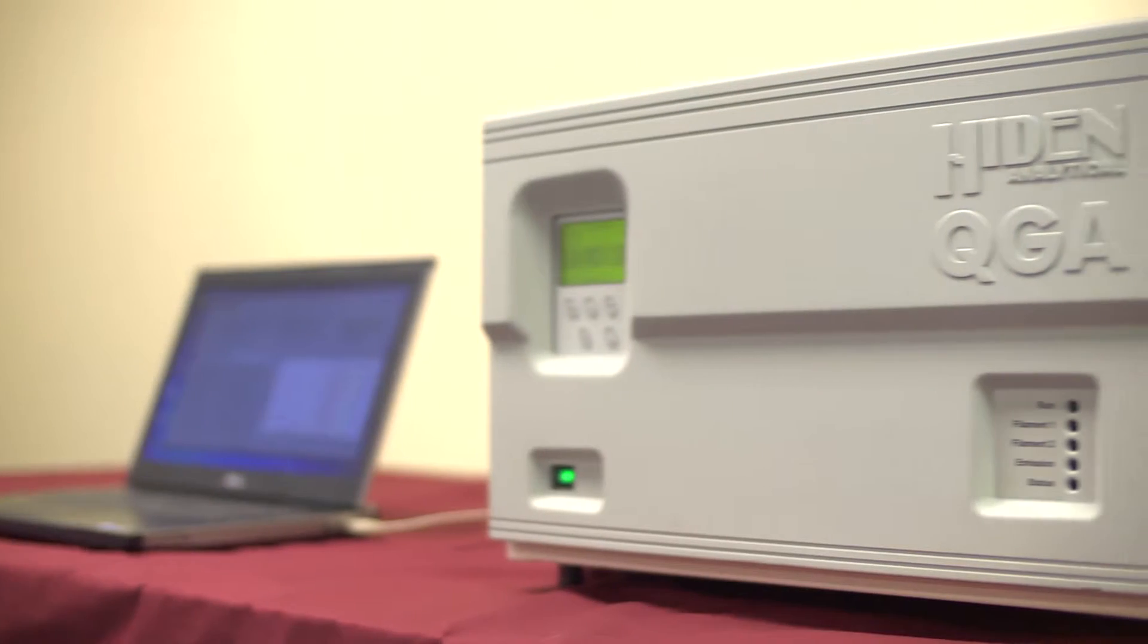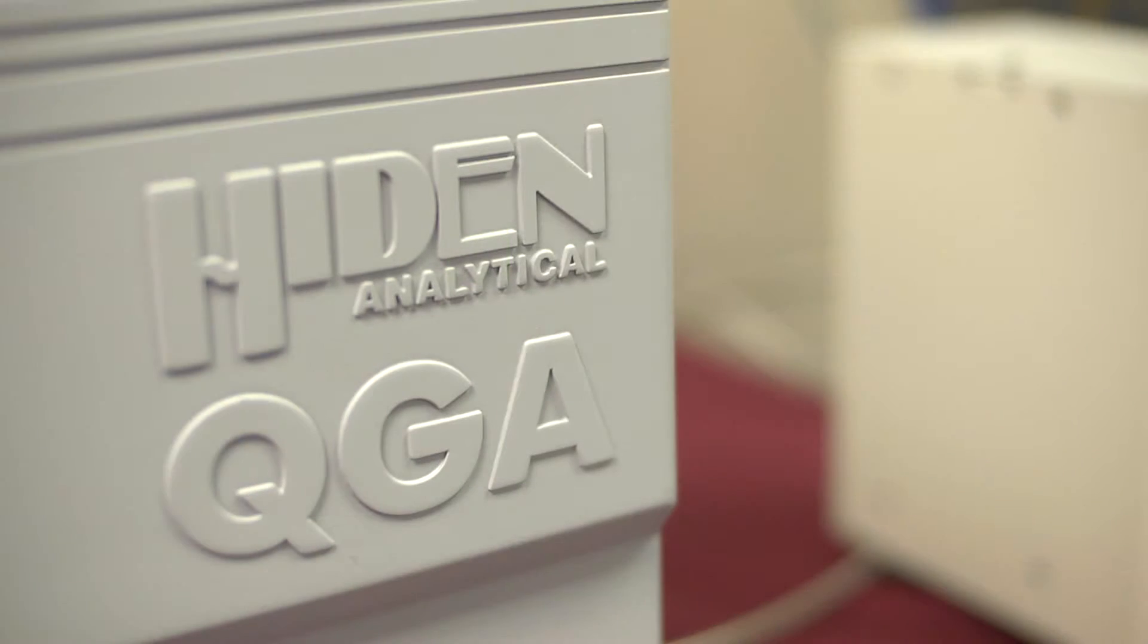The QGA system is a compact benchtop gas analysis system for analysis of multiple gases and vapors with a wide dynamic range and fast response.